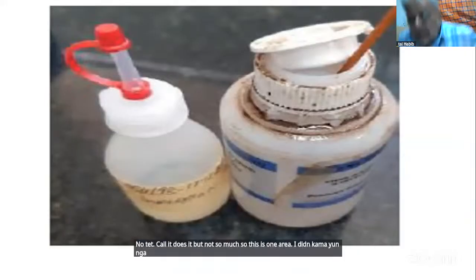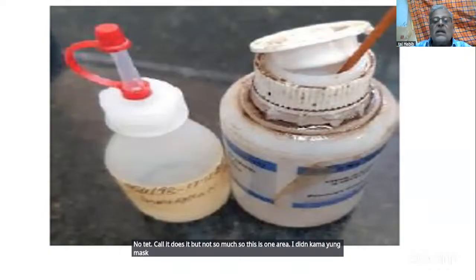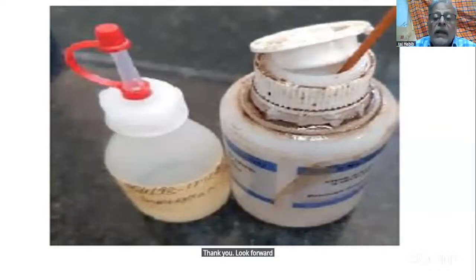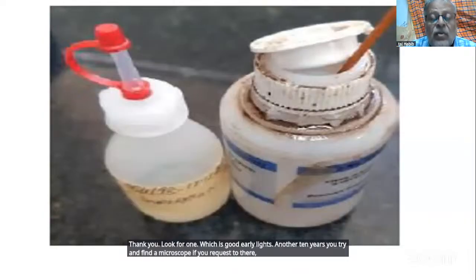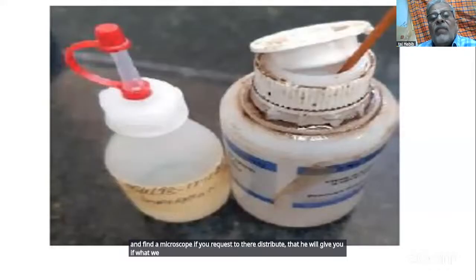When you're purchasing a microscope, you must try to look for one which has got LED lights. Another thing is, if you request the distributor, he will give you what we call a fungus protected microscope. So they seal it for fungi.